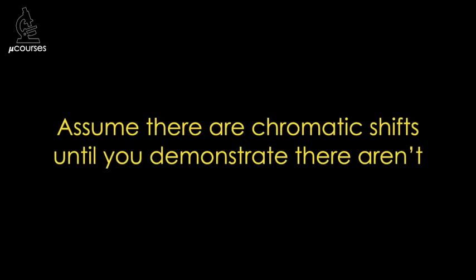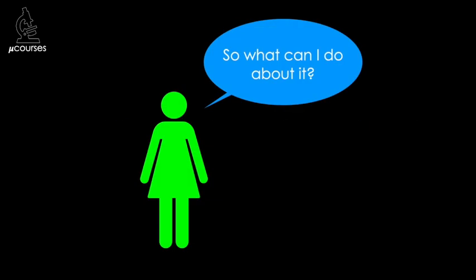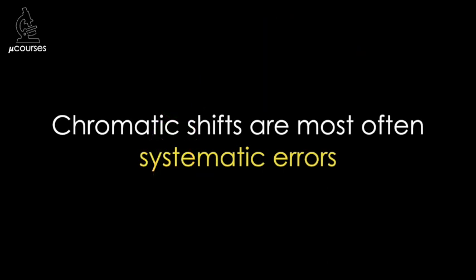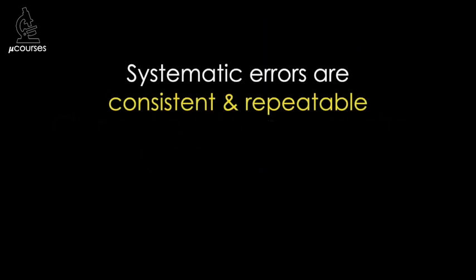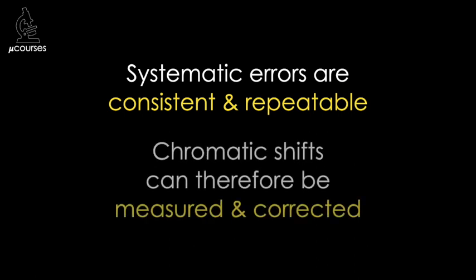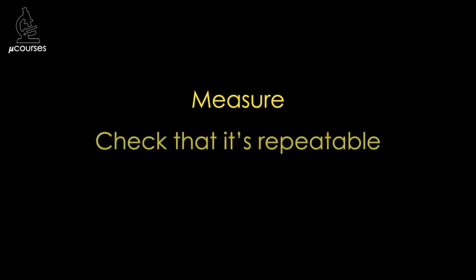With all of these potential sources, it's best practice to assume that your imaging system introduces chromatic shifts into your images until you demonstrate it doesn't. Chromatic shifts are most often systematic errors — errors that are consistent and repeatable — which means they can be carefully measured and corrected in your images. So you're going to need to measure the shift, make sure that the shift is the same each time, and then correct for it.